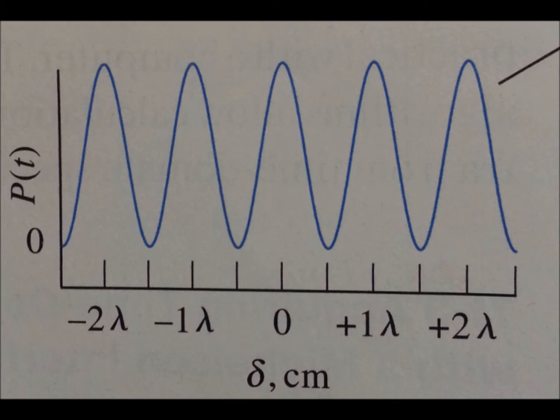The intensity of light that reflects off the movable mirror will vary depending on the position of the mirror when the radiation strikes it. Thus the detector will measure the variation in intensity between the two recombined beams as a function of their different path lengths. The difference in these path lengths is termed the retardation, which is represented by the variable delta. The plot of the radiant power in the time domain versus the retardation, delta, is an FTIR interferogram, which is described by a cosine function.